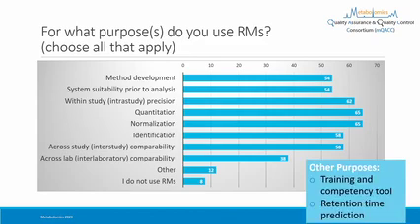And then in our discussion, other purposes came up, like a training material for newcomers to metabolomics, and also retention time prediction, which will aid in metabolite annotation.